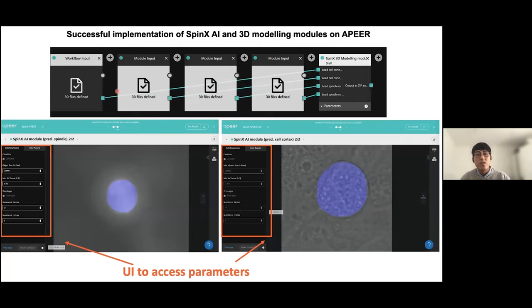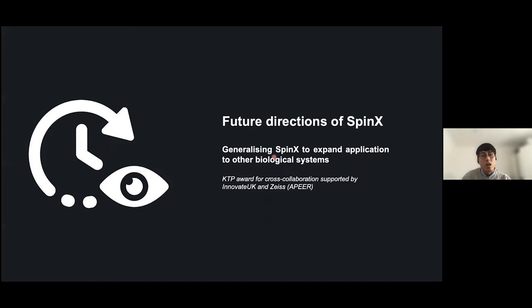We successfully implemented most components of SpinX on Apeer. These screenshots show the modeling workflow — it takes raw images and mask images — and here you can see the UI with access to the parameters needed for the SpinX AI module.